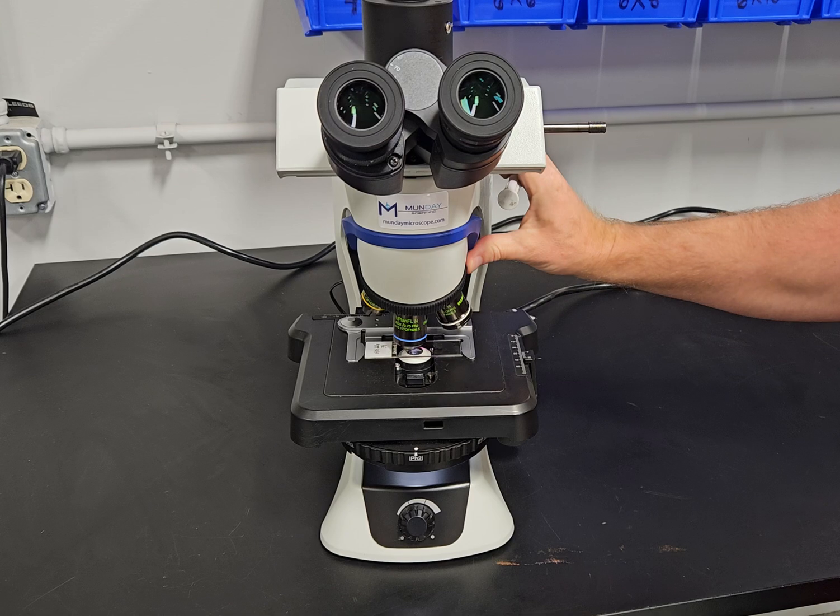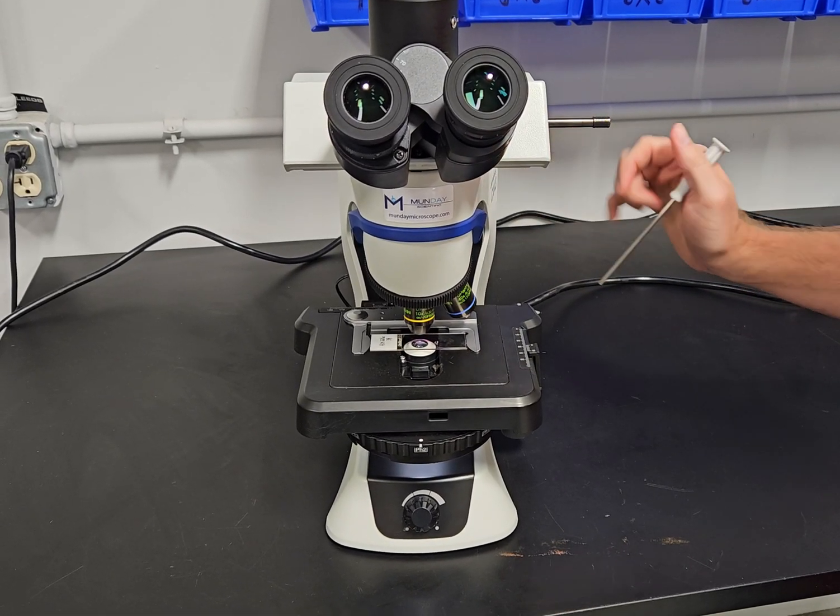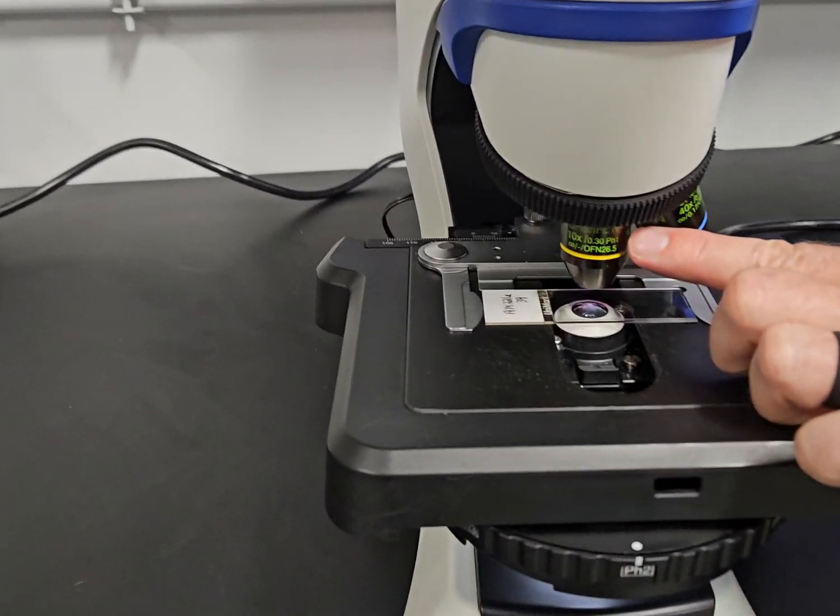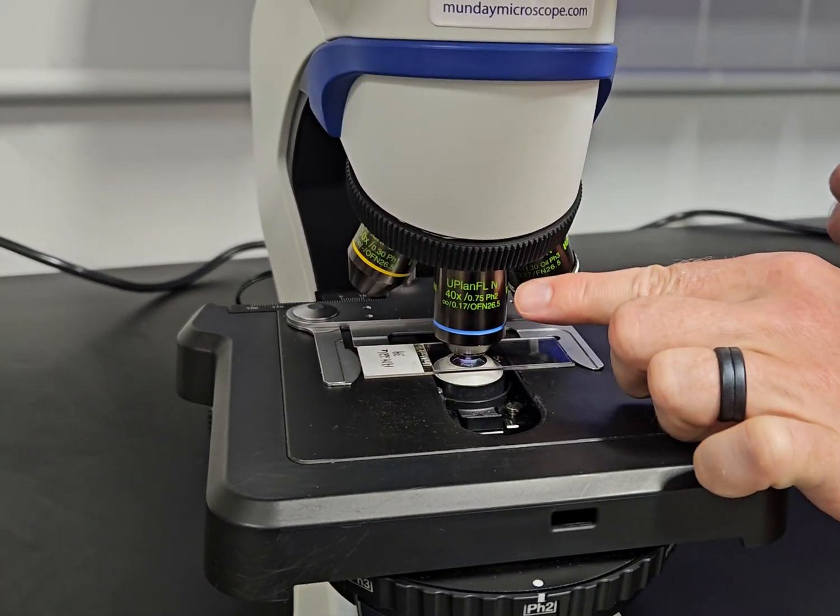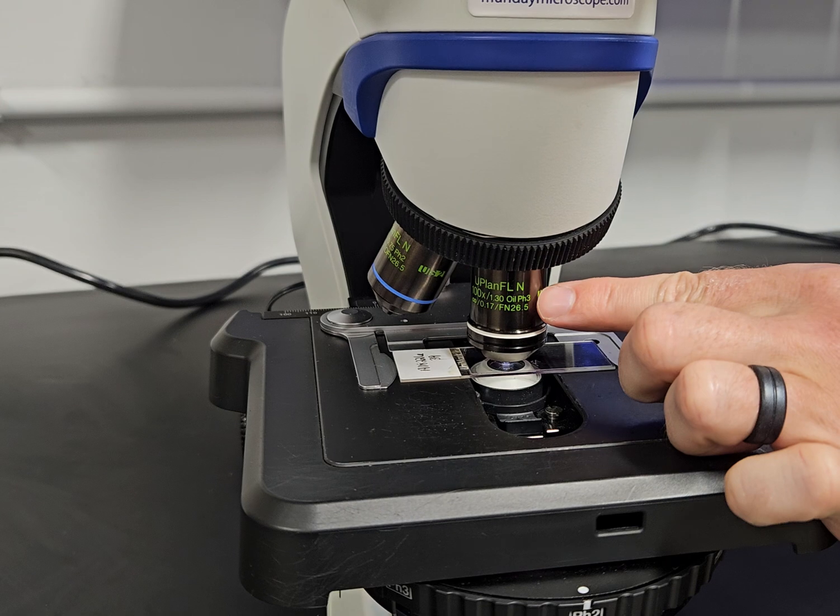Each one of these objectives corresponds to a different phase ring within the condenser. You can see this one says phase one pH one. This one says pH two. This one says pH three.